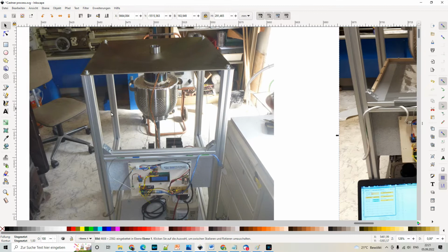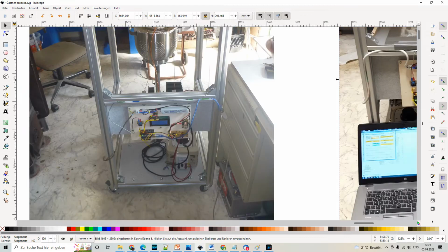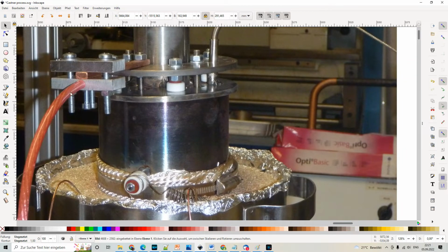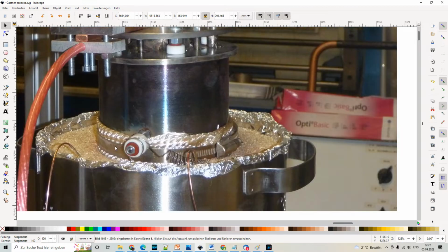This is another look at the Castner cell. Here I was scooping out the sodium. And this is a close view of the Castner cell. You see here the anode, and the cathode you can't see from this view, and here is the thermocouple to get the temperature of the melt. And this is the outer heating element, and this is the sand insulator here.